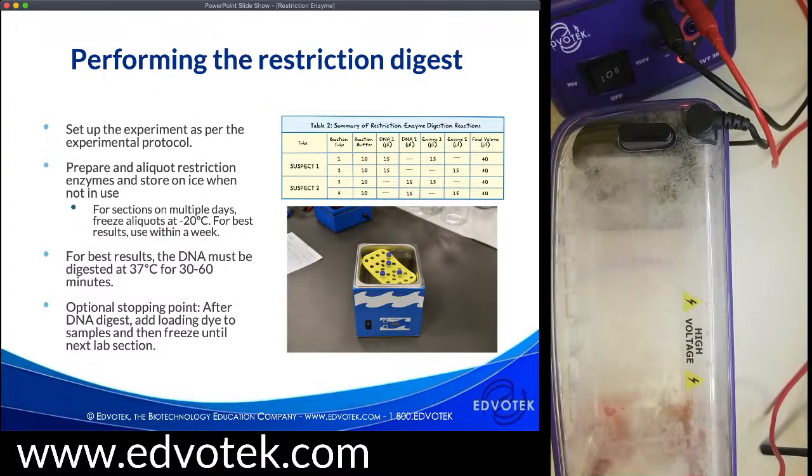For teacher prep, you are going to prepare and aliquot the restriction enzymes and store them on ice when not in use. In general, we recommend you prepare the restriction enzyme and use it on the day that you have prepared it. However, if you have sections on multiple days, after you prepare the enzyme and aliquot it, take those aliquots and put them right in the freezer — because the prepared enzymes are going to degrade if you leave them on ice or in the fridge. I recommend you use it within a week for best results. That means if all your students over the course of a week are doing the same experiment, you could prepare the enzyme on Monday and on Friday your students will be able to use the same kit.